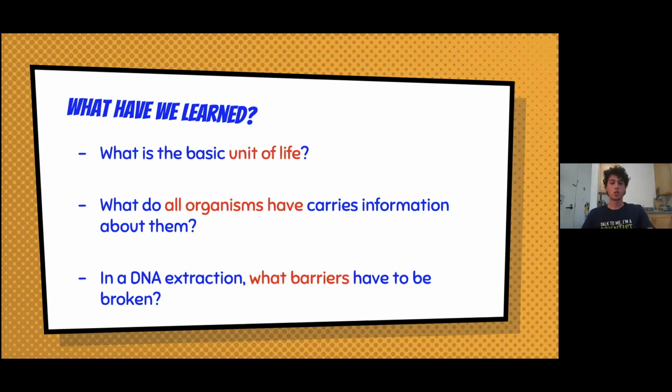What barriers had to be broken for us to extract the DNA from the strawberry cells? Matthew was answering this question earlier on. So maybe I can give you a couple of minutes now to reflect on what we had to do to actually be able to reach the DNA inside the cells.